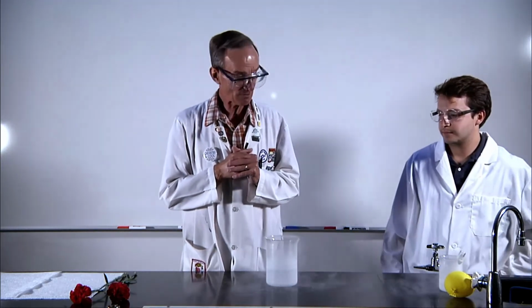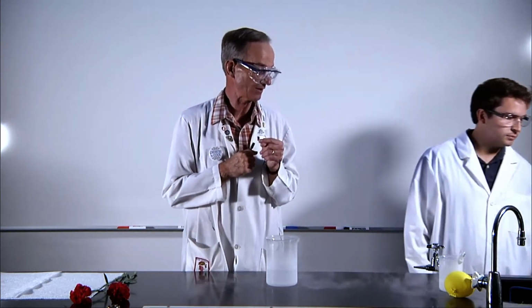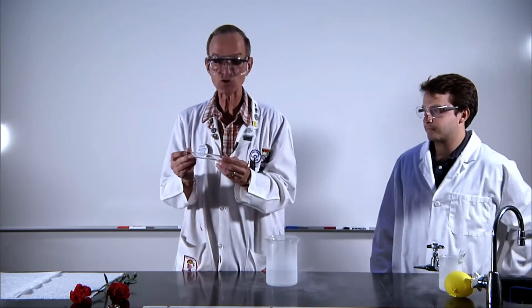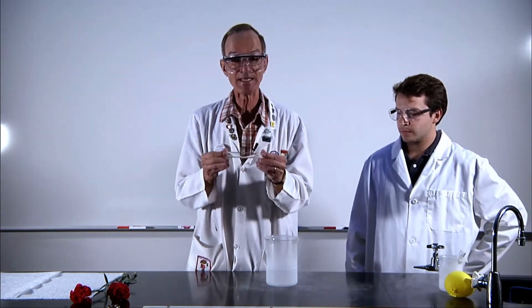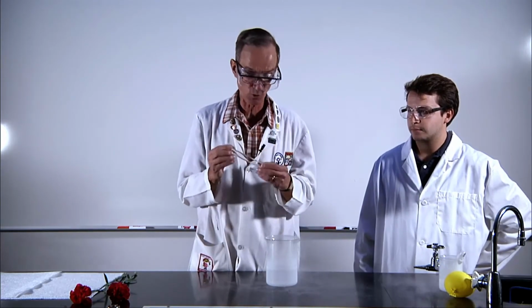Now we're going to do a couple of demonstrations for everybody that shows them how cold it is. Now the first demonstration I've actually started here, and Jack, if you'd reach for that test tube right there, that'll do it. That's perfect. Now right now the test tube has air in it. So it's about 80% nitrogen, 20% oxygen. So it looks like there's nothing in there, but of course air is.